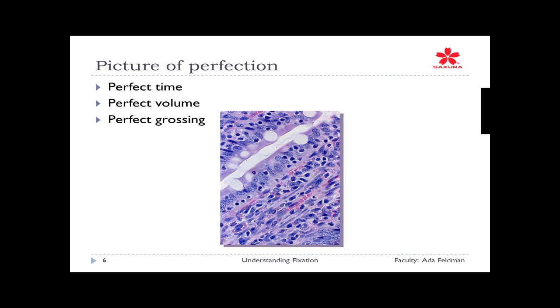But let's go to the next slide and see what the world of perfection of fixation can provide us. Give it the perfect time, give it that perfect volume, perfect grossing.